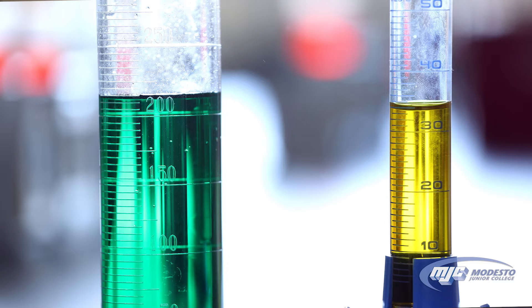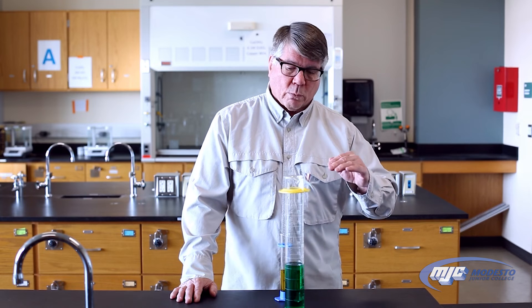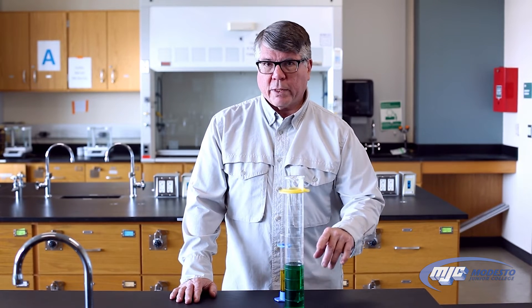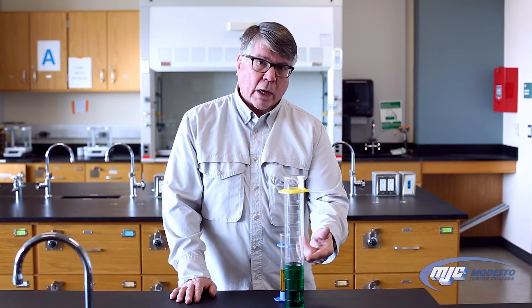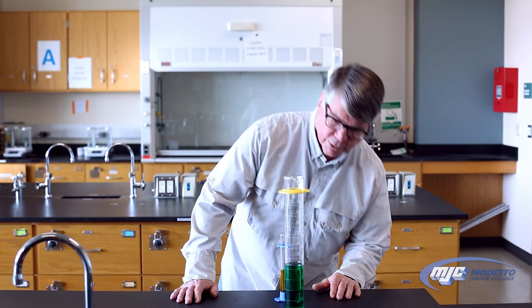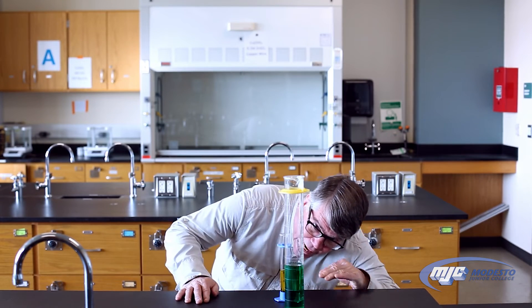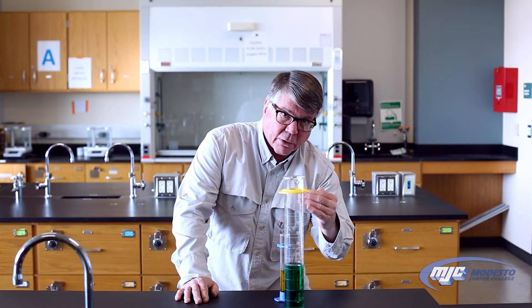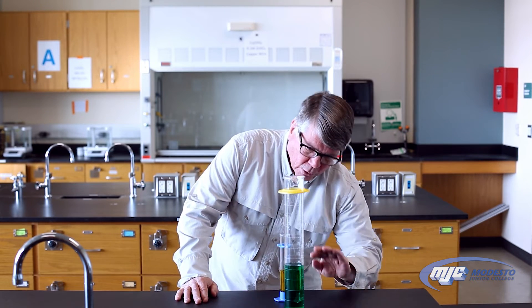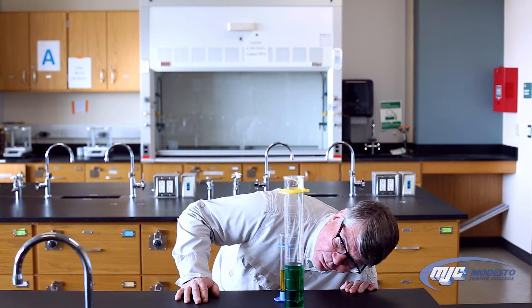One thing we have to be careful of when reading a volume in a graduated cylinder — or any cylinder that has a liquid in it — is that the top of the liquid is at eye level with us. If I were to read this volume right here, I would need to make sure that I'm down at that level. If you're not, parallax will cause you to read it incorrectly if you're above or below the level.